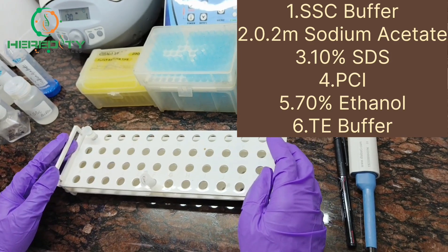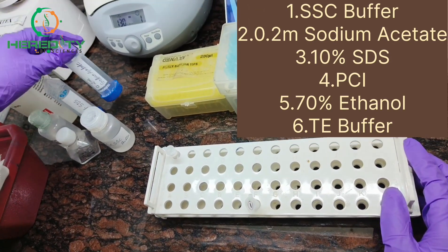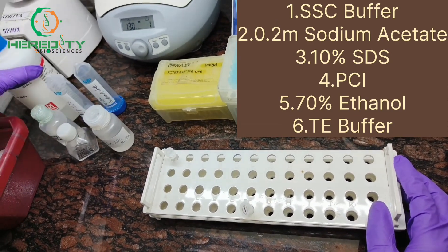For blood DNA isolation, we need 1x SSC buffer, 0.2 molar sodium acetate, 10% SDS, isopropanol, 70% ethanol, and TE buffer.